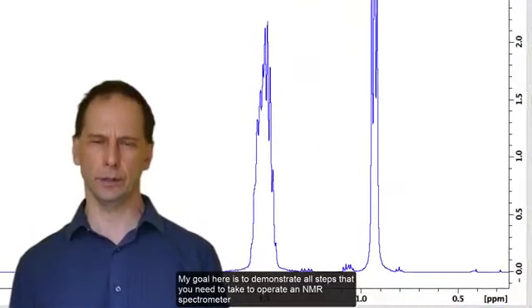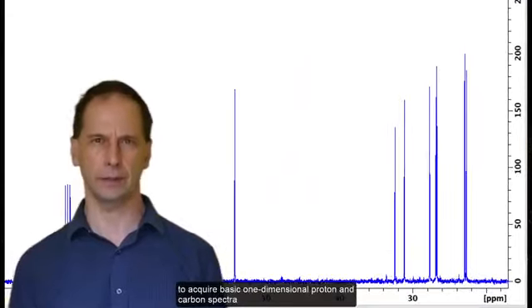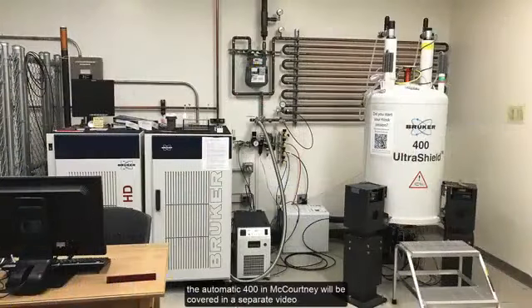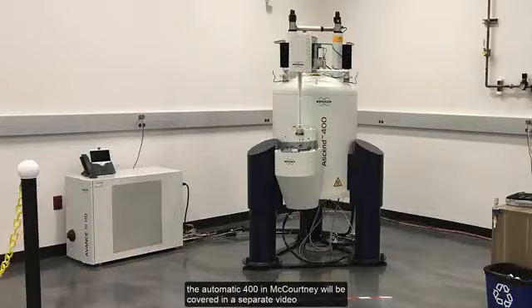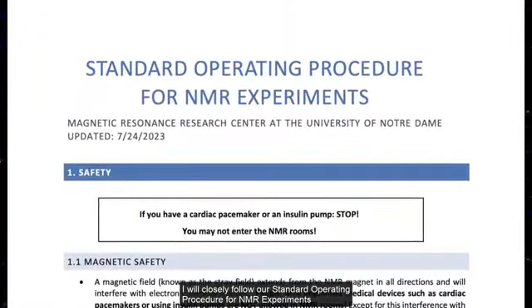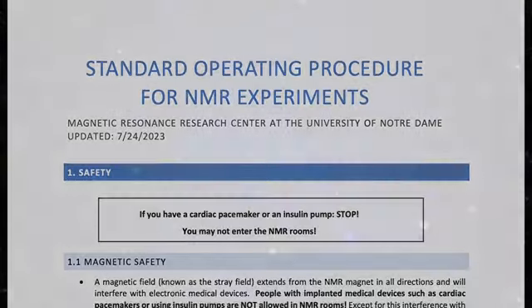1. The physical basis of NMR: spin, magnetic moments, and polarization. The nuclear spin. Certain atomic nuclei possess an intrinsic property called spin, quantified by the spin quantum number, I. Nuclei with I not equal to 0, e.g., 1H, 13C, 19F, 31P, with I equals 1/2, behave as tiny magnetic bars.